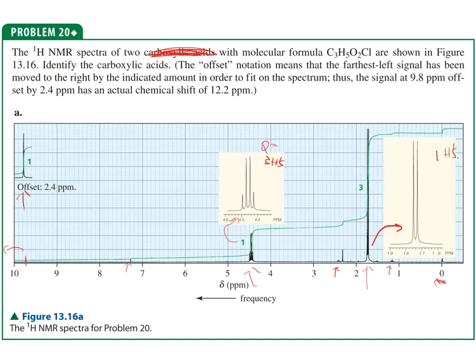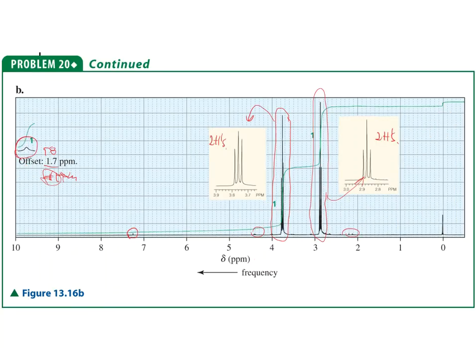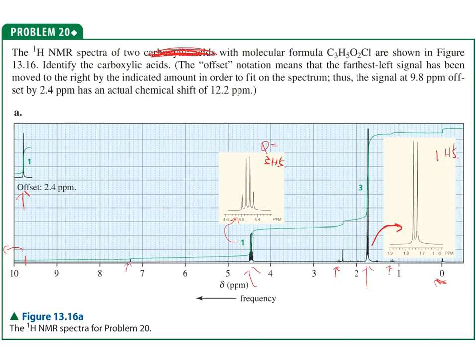If I go back to the NMR, I see a major signal showing up there, and another major signal showing up here. And then you're also seeing something over here on the far left-hand side that they've squeezed onto the chart. And then here, you're also seeing the same thing. This is a major signal. This is a major signal. And then look at that funny little squiggly thing. That's way over on the left-hand side, and they've squeezed it onto the NMR just to tell you there was something little there as well. What that is, we don't really know.